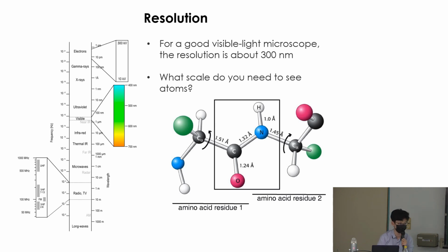Is that clear so far? Yeah. So 3 angstrom wavelength, what is that? X-ray. X-ray is here, in the angstrom range. That's why we usually use X-ray crystallography to determine protein structure. But look at this, electron. Electron has much more potential to see the finer detail, in theory so far. Theoretically, it can reach much smaller wavelengths, so you can see much finer detail. Okay, you got the first concept.